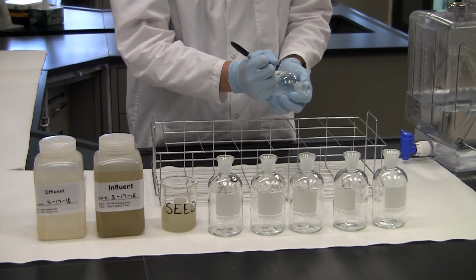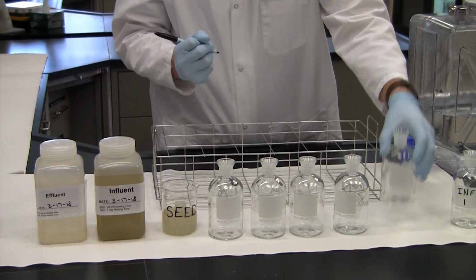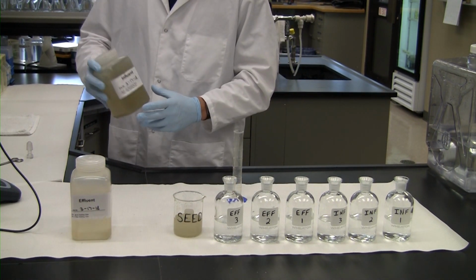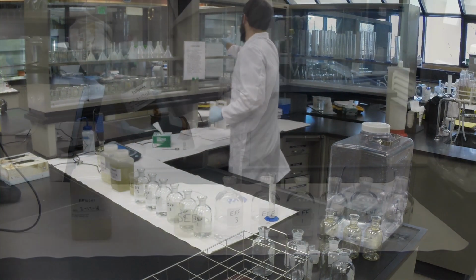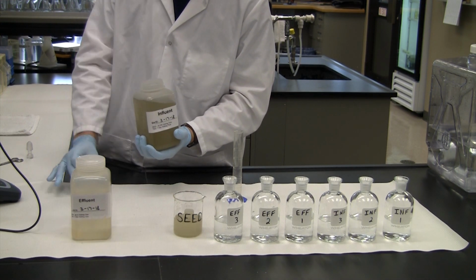For the initial setup, start placing your bottles on the counter or in a BOD rack. Label the bottles if needed. Determine the seed amounts and the sample amounts for each bottle. Record all of this information on the bench sheet or in your LIMS system. For example, if you have a sample with a BOD history of 50 to 110 milligrams per liter, you will want to set up your samples so that they bracket these values.